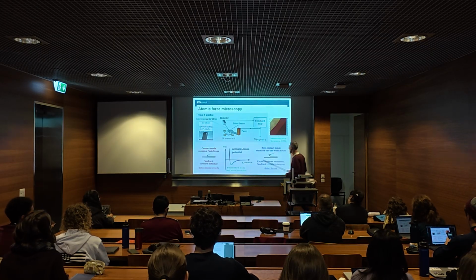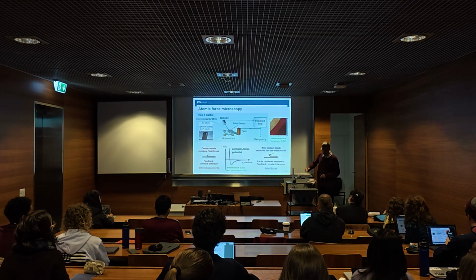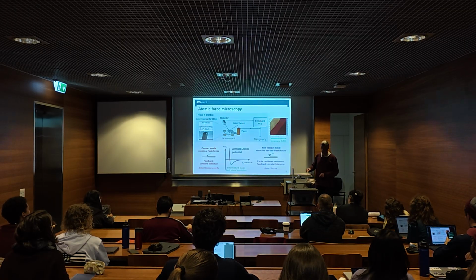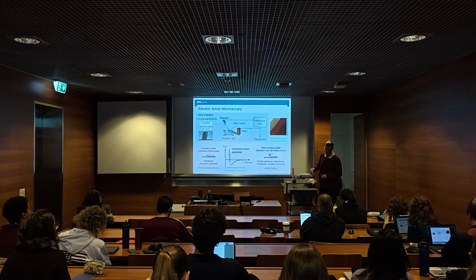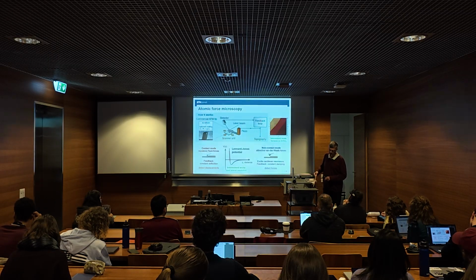The other way is you always keep the same force, so then you hover, and so it's constant damping. So then you detect the interaction with the surface, not really the contact, but now it's again attracted, you move, detection, the force goes down, so then you go closer to the surface, the force comes again, so the force gets stronger, so you move up.